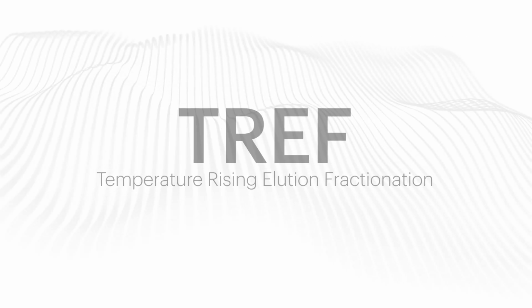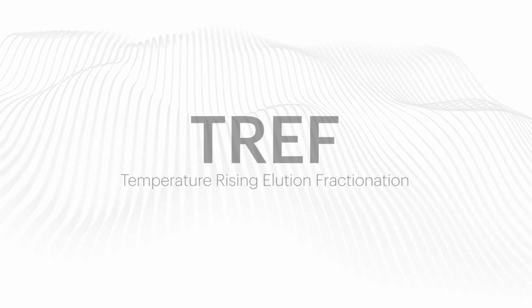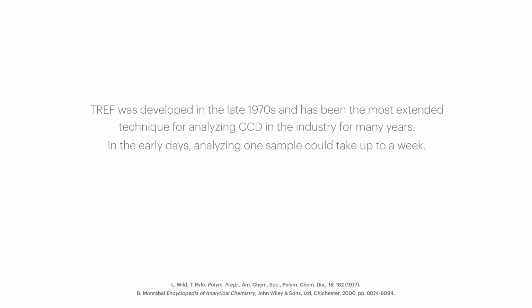TREF, temperature rising elution fractionation. TREF was developed in the late 1970s and has been the most extended technique for analyzing CCD in the industry for many years. In the early days, analyzing one sample could take up to a week. Today, it can be performed in under 2 hours.